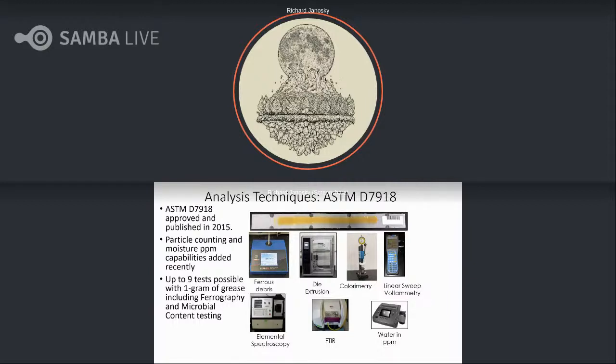As you see on top there, we have our extruded sample, which shortly we'll be running through an example showing you how we prep and do that for a sample. But you can see that thin ribbon that is extruded across the substrate. And it's nice that you can see in the picture, there's individual sections that can be peeled off. Then each section can be used for its test. And it's nice that you don't need to rely on a scale. It's prepared and ready for further analysis after you've done die extrusion.